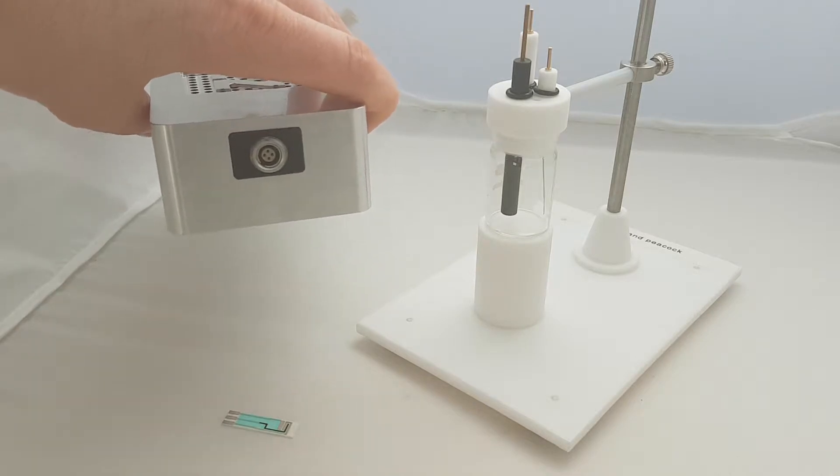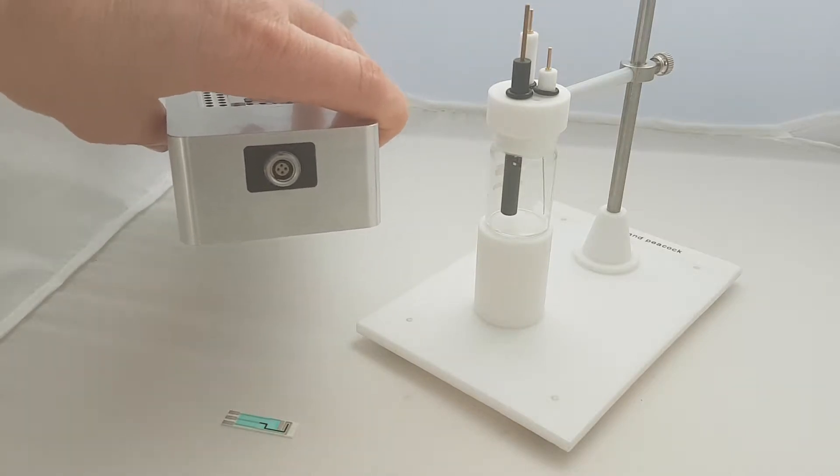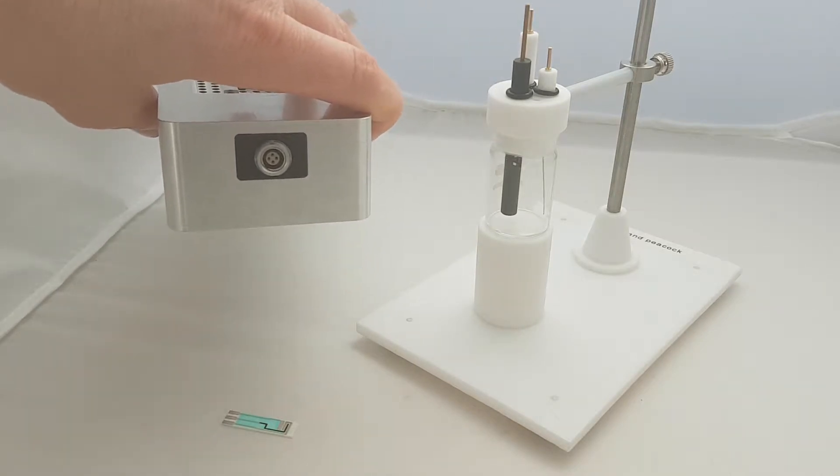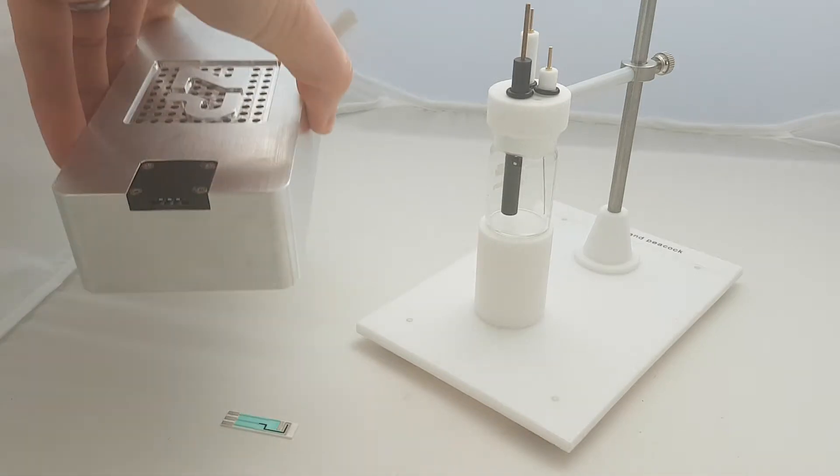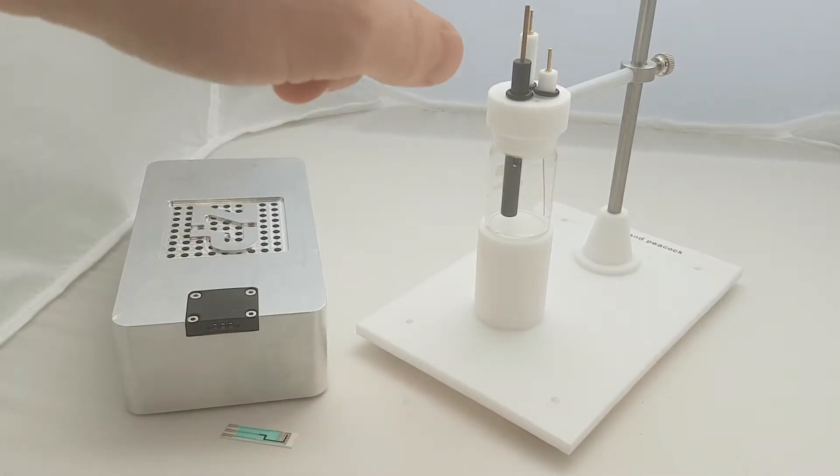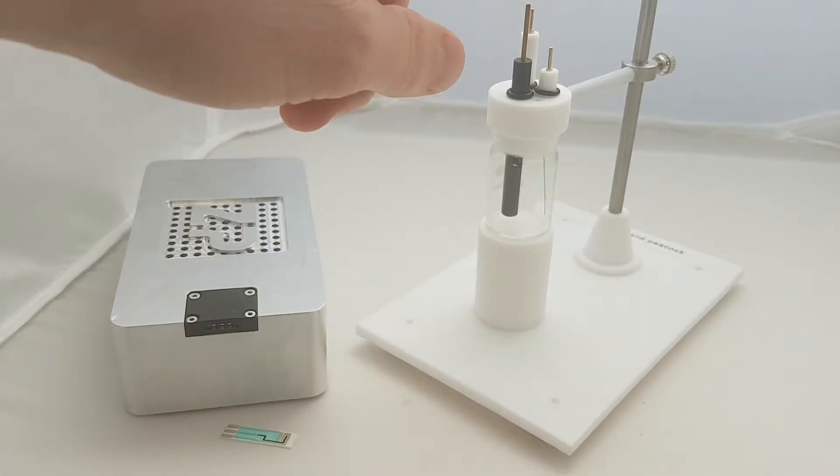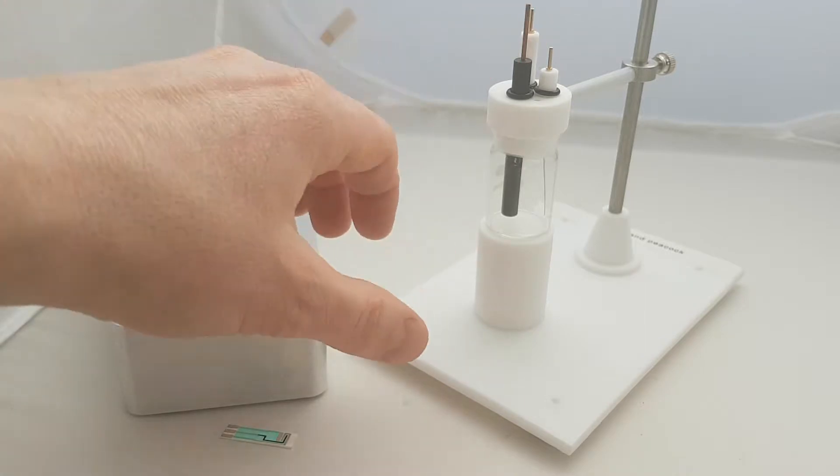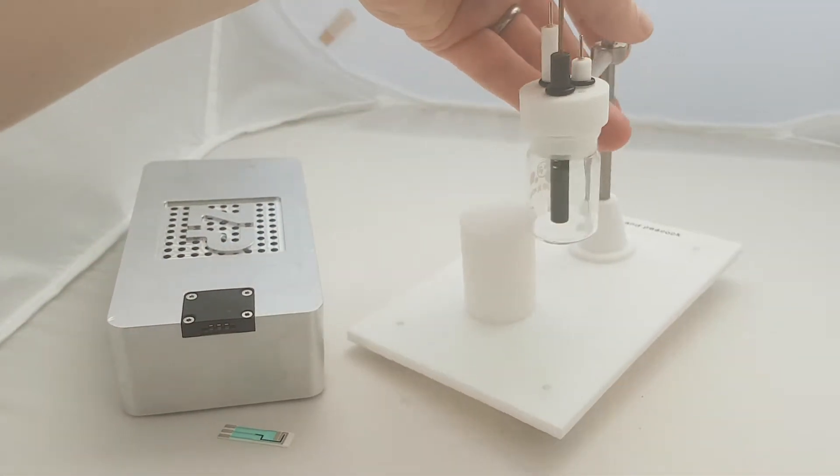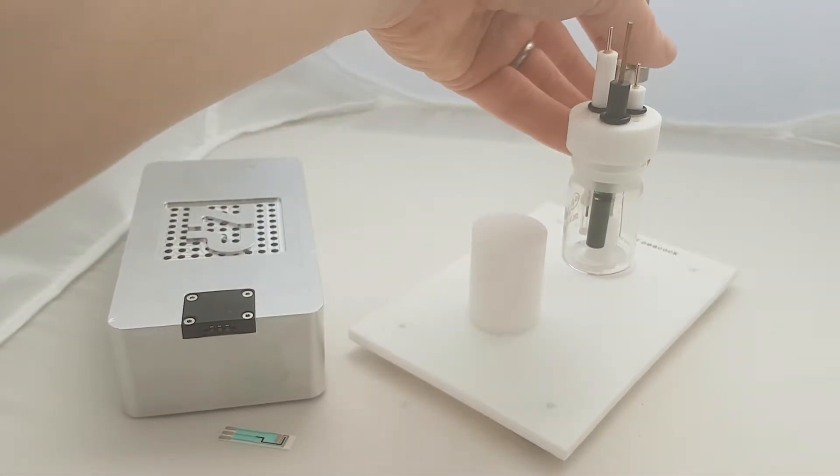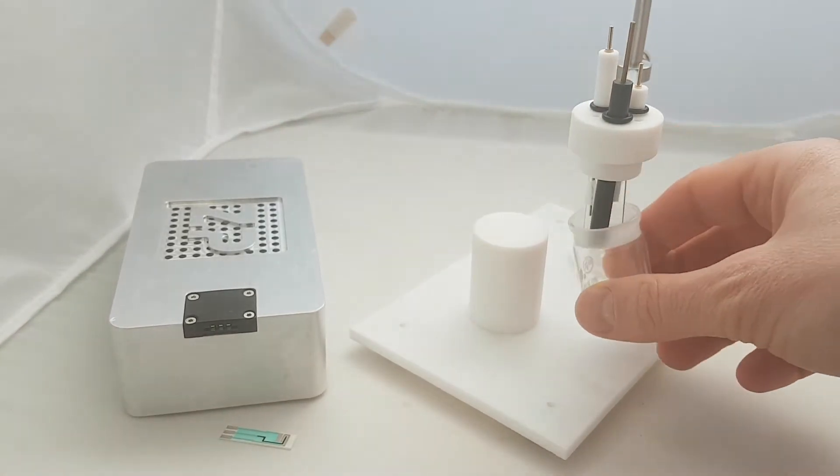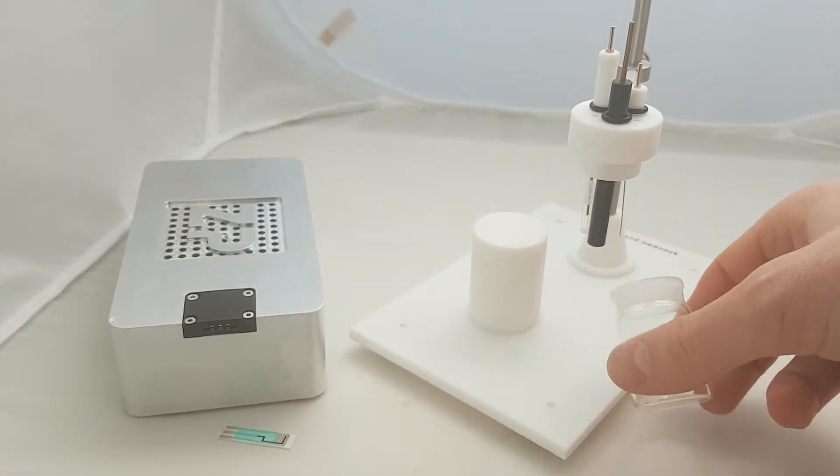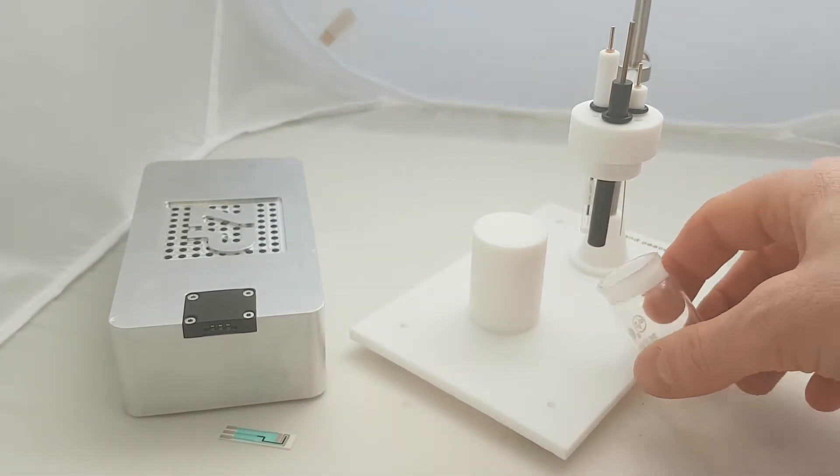We have all sorts of flow adapters for that, but that cable also allows us to run connectors out to an analytical cell such as this. What this analytical cell allows us to do is have a solution that you're trying to analyze.